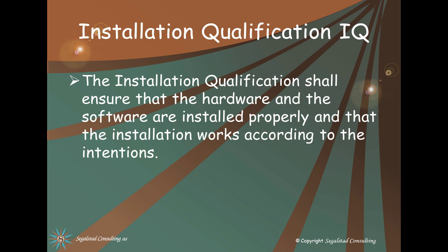The IQ installation qualification shall ensure that the hardware and the software are installed properly and that installation works according to the intentions. The IQ is by far the quickest of the phases. We basically need to keep track of all hardware, software, and the choices selected when the system is installed. There will eventually be more than one instance of the database.